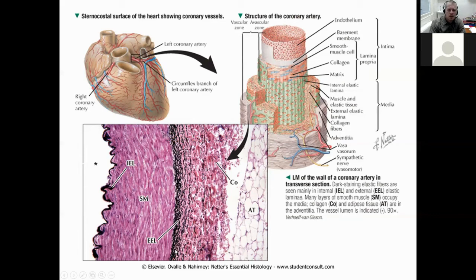It's in some special staining methods. This is, for example, a combination of a Van Gieson method that stains the muscle and the collagen, and a special hematoxylin that stains the elastin black. So, you know, in histology we use a combination of various staining methods according to what we want to see. We use that or that or that staining, so we have a whole palette of stainings, so we need to be familiar with it. I will then show you more pictures showing how elastin stains in hematoxylin, eosin, etc.